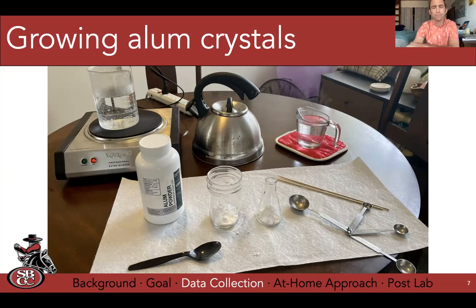So a hot plate, a tea kettle, or even just using a microwave will work. The lab manual calls for a hot water bath. You can use a hot water bath and then put another container within that to heat it up without worrying about contamination of your solution.